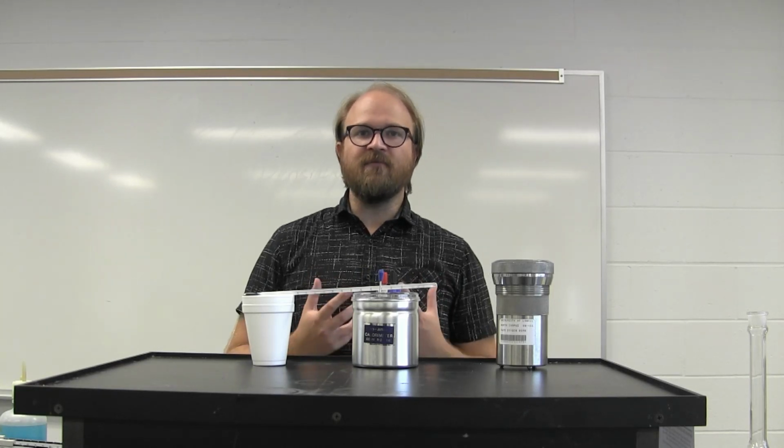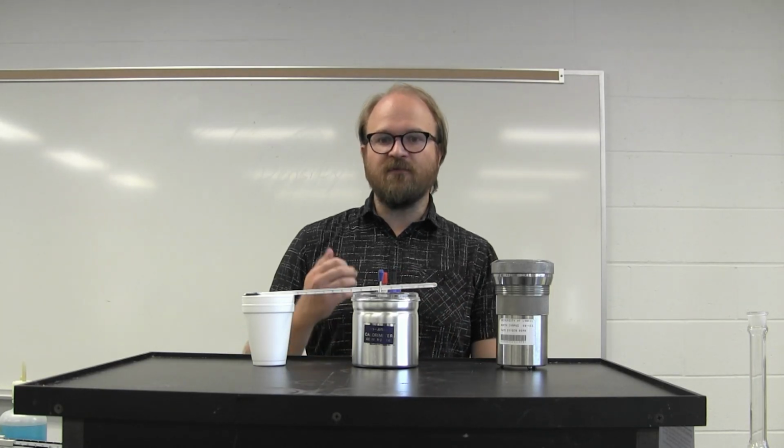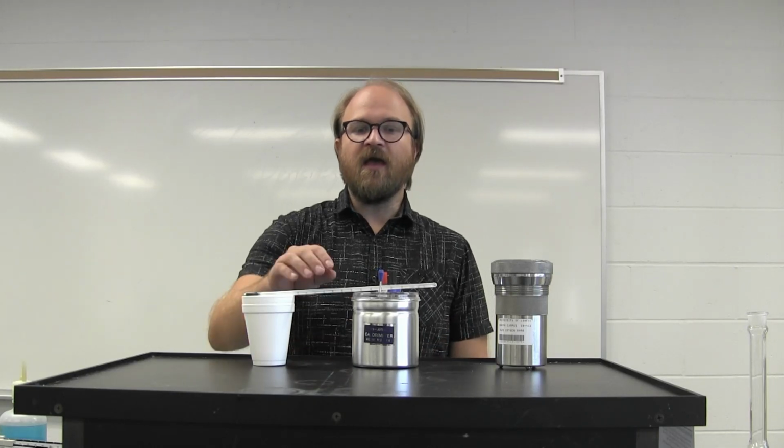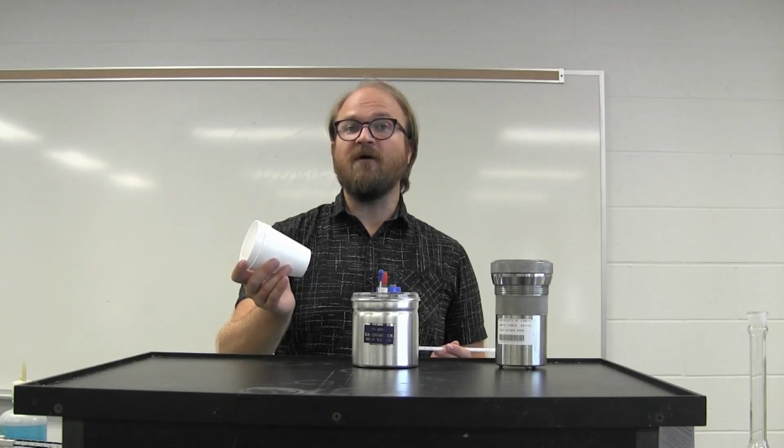The energy from the reaction is transferred to the calorimeter or the water contained in a calorimeter, and the change in temperature is measured. While a bomb calorimeter is an expensive calorimeter that is very adiabatic and very little energy is lost to surroundings, a very simple calorimeter is just styrofoam coffee cups.